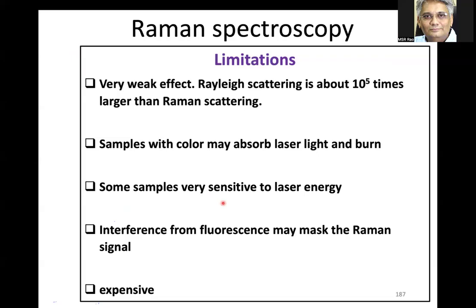Laser Raman spectroscopy these days needs a very powerful laser, so the technique can also be expensive.